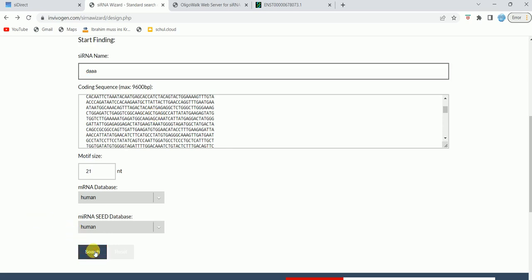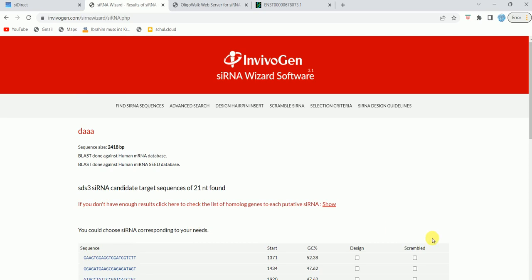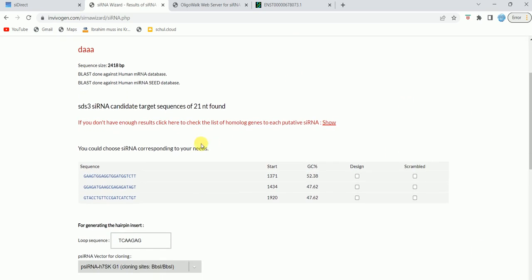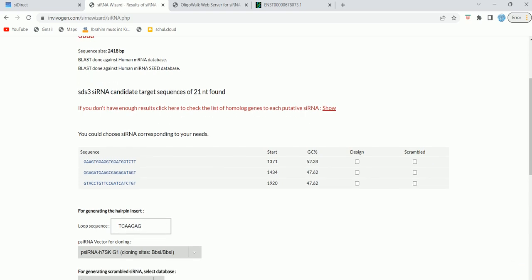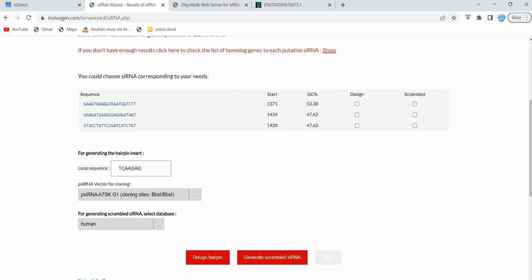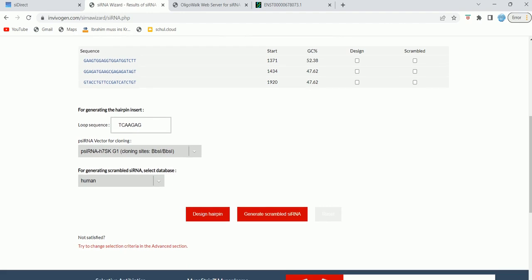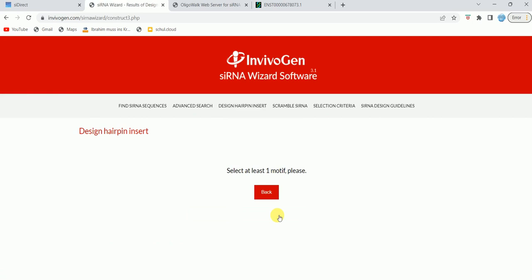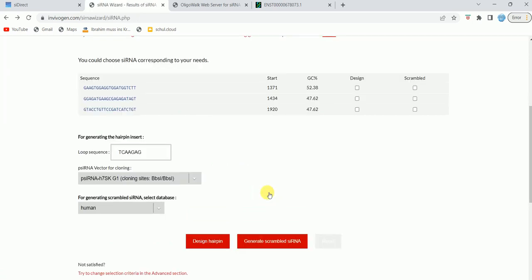For the miRNA database, I also selected human because my coding sequence is from human. After that, just click on search. As you can see, you could choose siRNA—it shows here this sequence and then you could choose siRNA corresponding to your needs. It has found the siRNA list and these are the sequence list. For generating hairpin, you can use that and design hairpin. If you want to generate scrambled siRNA, just click on generate scrambled siRNA. You have to select at least one motif—I didn't select, so I'm just going to select. You have to select for which sequence you want to design the siRNA. I selected the first one and then it will generate.